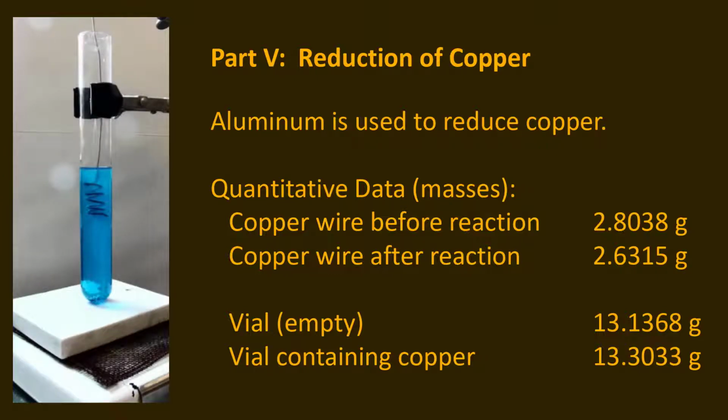So some of the acid is going to get reduced to hydrogen gas. And then that process of clearing off the aluminum surface and revealing fresh aluminum metal gives the copper an opportunity to react with the aluminum metal and to precipitate out.